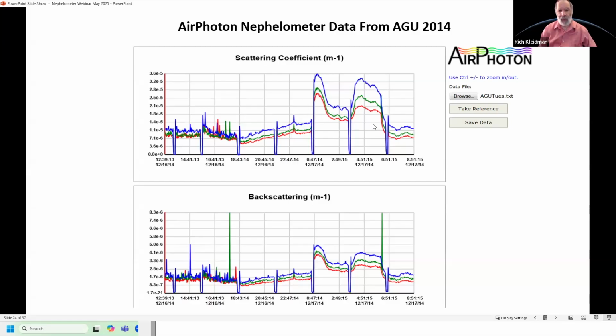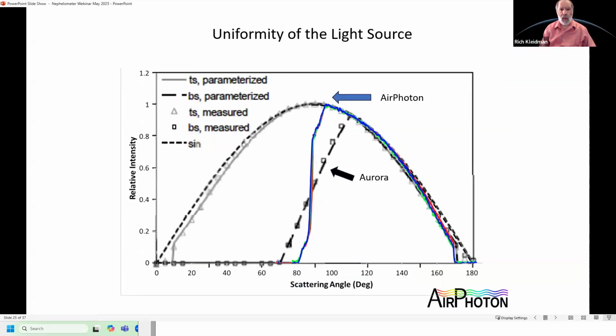And after some investigation and consultation with our friend who's an atmospheric chemist, what she told us is that they're using cleaning solvents either on the carpeting or the floor, and then they're volatilizing. And what you're seeing here is gas to particle conversion. So what this tells us is that nephelometers can be extremely sensitive to small particles if you're seeing the gas to particle conversion, which we were in this case.